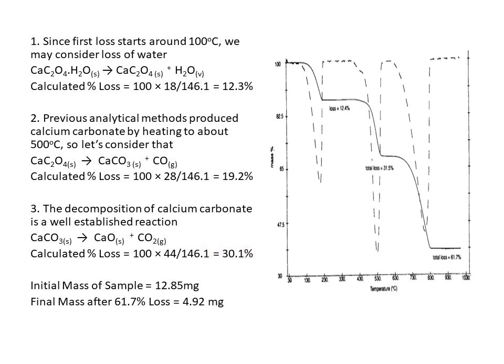One more thing I want to include here: the products obtained here, whether they are gases or solids, should be characterized by other analytical methods. X-ray diffraction may be used for solids, and other chemical tests may be used for gases, or we can even use evolved gas analysis.